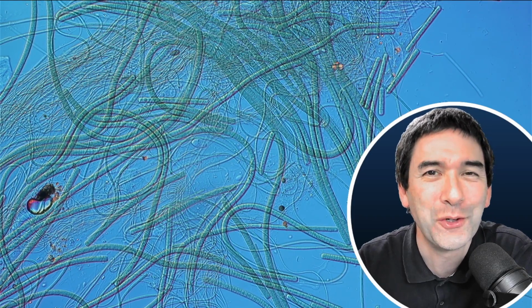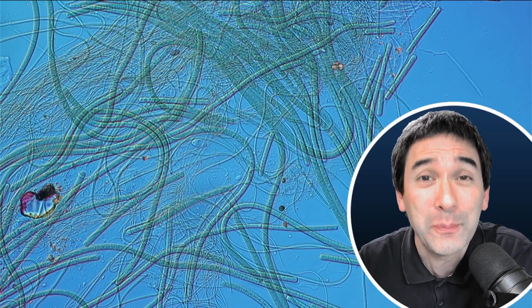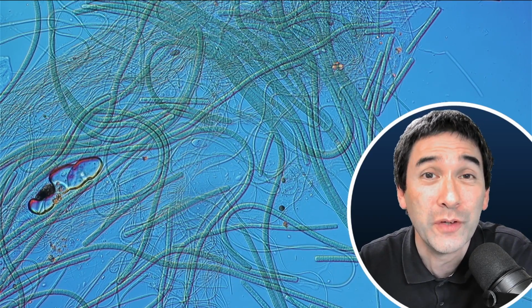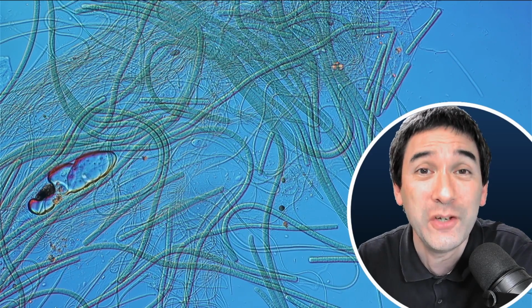Microbehunter here. Well, these are not worms, but these are so-called cyanobacteria. Cyanobacteria are bacteria that do photosynthesis. And as a matter of fact, what we see here in each one of those filaments, each filament is not one bacterium, but actually composed of hundreds, if not thousands, of individual cells.